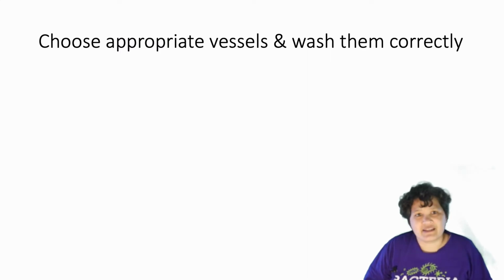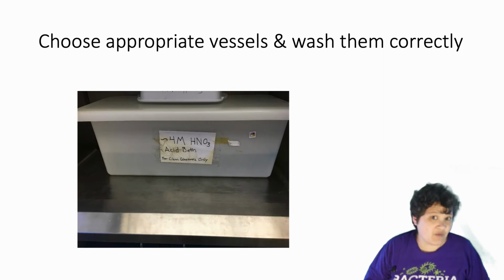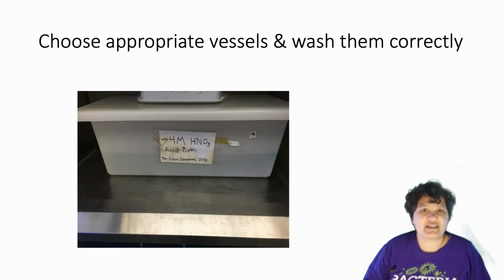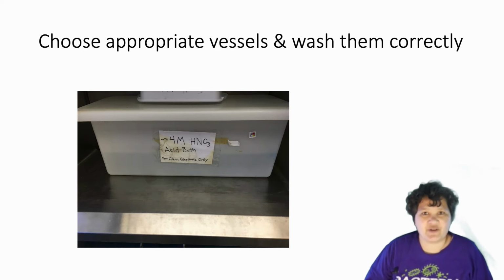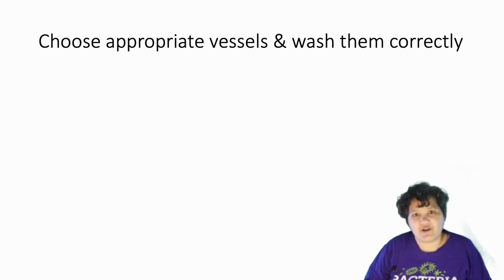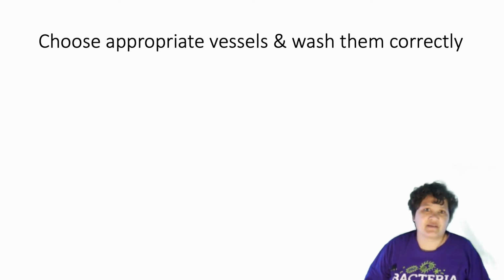When doing metal analysis, the best way to clean glassware, bottles, or other tools is to acid wash them. Now, metals are very likely to stay in solution in highly acidic environments, which keeps them from adhering to surfaces. But just acid washing is not enough. The biggest source of metal contamination in the lab is actually dust blowing out from the HVAC system. So we never air dry bottles that have been acid washed. These are always stored in a plastic bag or other container to protect them from dust.